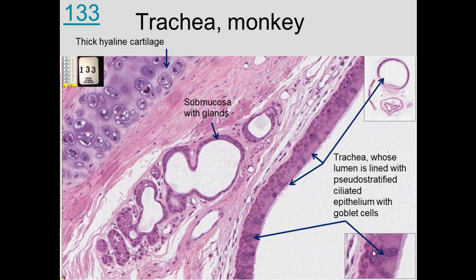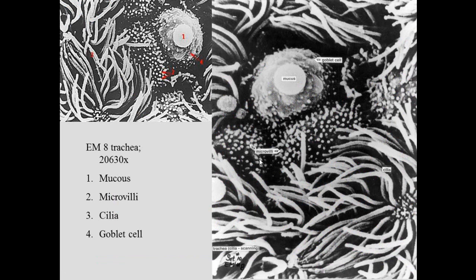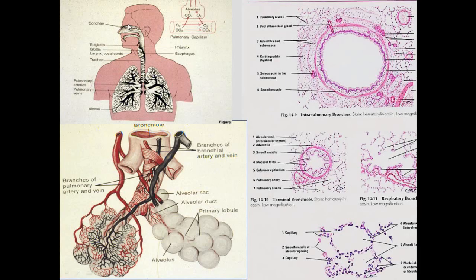In the trachea of a monkey specimen, you can see the hyaline cartilage, perichondrium, submucosal glands, and respiratory epithelium with a very thick basement membrane. At higher magnification, you see ciliated cells, goblet cells with secretions, basal bodies of the cilia, a thick basement membrane, rich vascular supply, and plasma cells in the lamina propria producing antibodies against antigens inhaled with the air. Under scanning electron microscopy, individual cilia, microvilli on goblet cells, and mucous secretions are clearly visible.